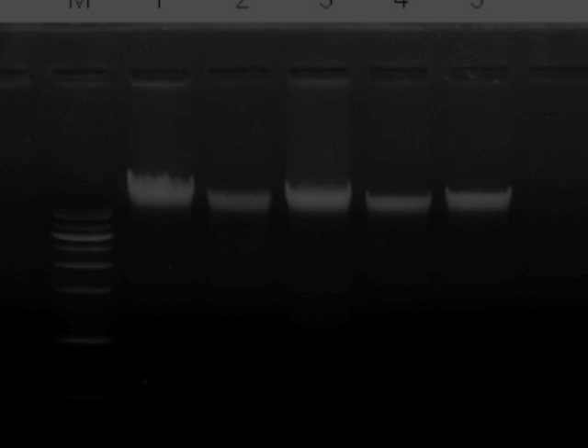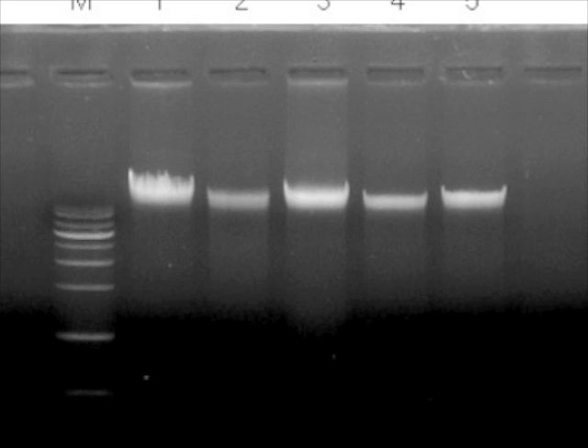The DNA sample to be analyzed is isolated and is documented using agarose gel electrophoresis, and the gel is used for blotting.